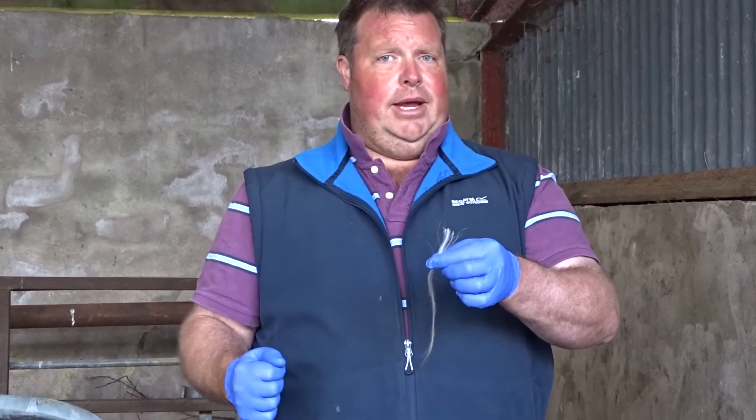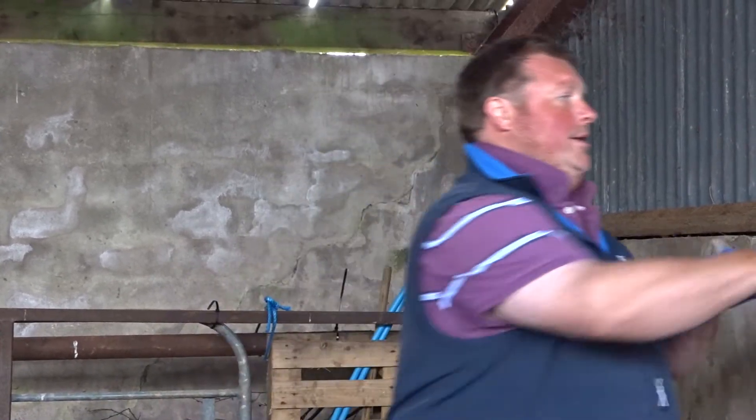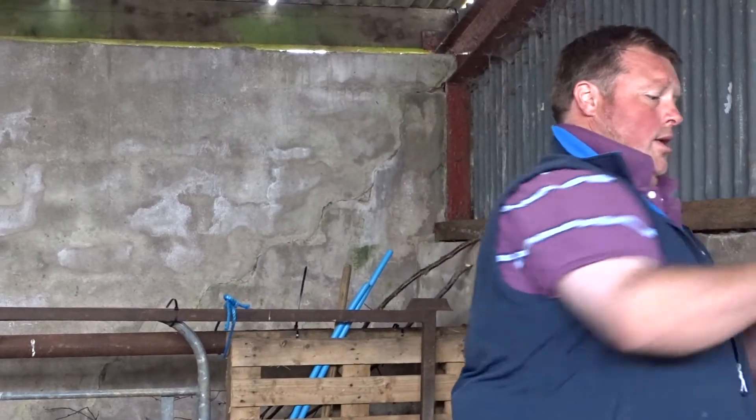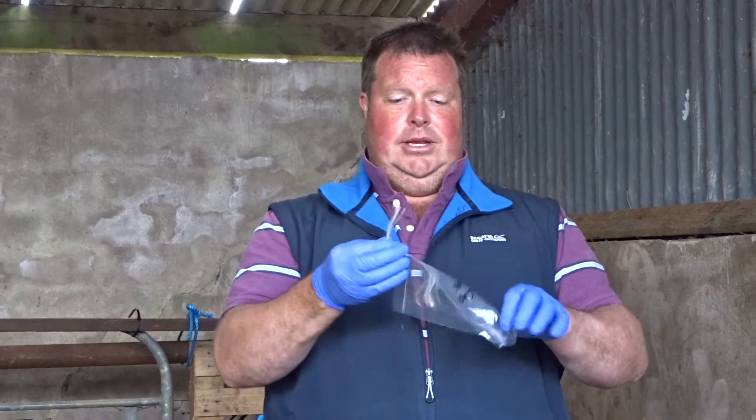So you have to pluck the hair, but if there is dirt on the outside, I don't mind cutting it off. I cut it off like so — that's the dirty part away — and the root follicle part goes into your bag.